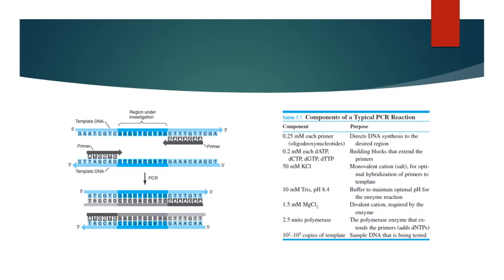They basically covalently attach to the thymines and the uracils in the DNA and RNA chains. These psoralens are really bulky additives, and they prevent denaturation and amplification of the treated DNA. So you don't want to do this for your target DNA. You do this for the products that are left over.